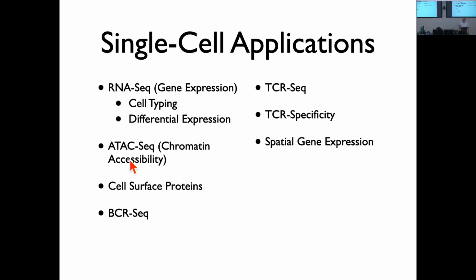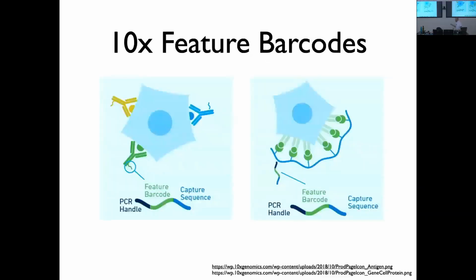And I don't know if I've mentioned this already, I think I glossed over it. I keep on referring to 10x. There's a company, 10x Genomics, that's the biggest maker of equipment and reagents for single cell RNA-seq. There are other companies still in business, and different research labs have developed methods, so you don't have to use the 10x platform. It's just the most popular. Most of the single cell RNA-seq data out there is coming off 10x machines.